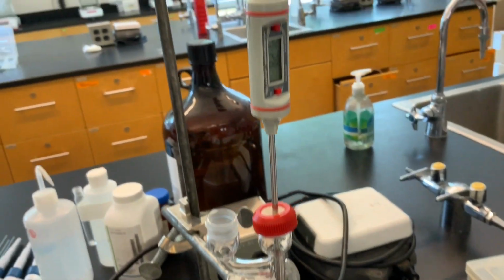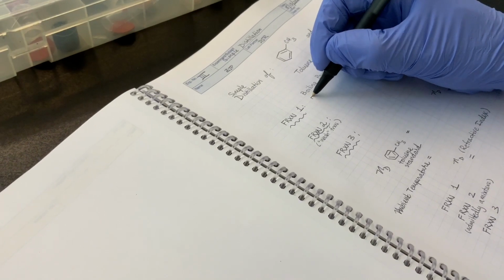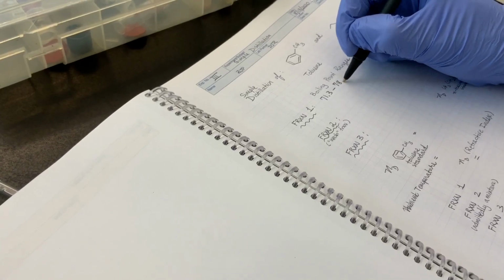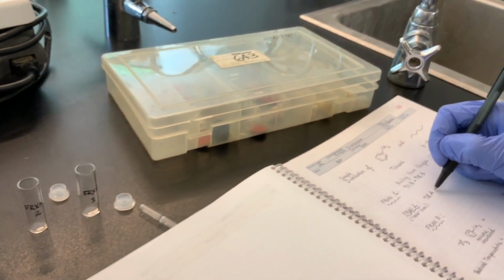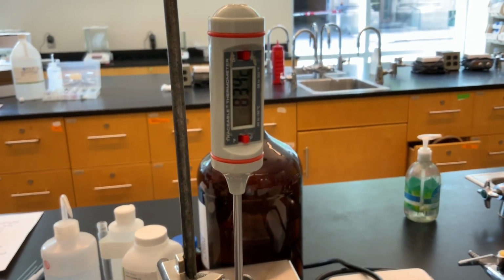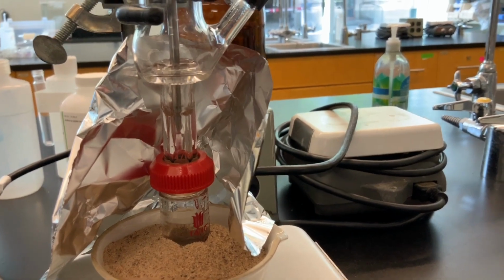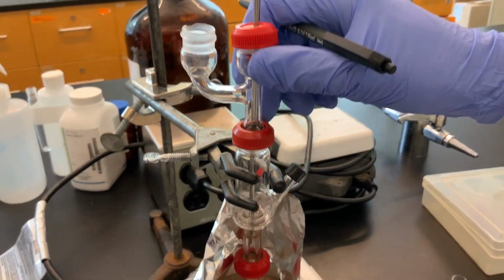So while that's still distilling, if we look at our notebook here, fraction number 1, our boiling point ranges were 71.3 to 78.3. And then fraction 2 is then 78.4 to, and we're still climbing up to around 83.2. And we should hopefully try and gather what we can for the second fraction before there's too much volume in there. And so now what this is distilling over should be our toluene.